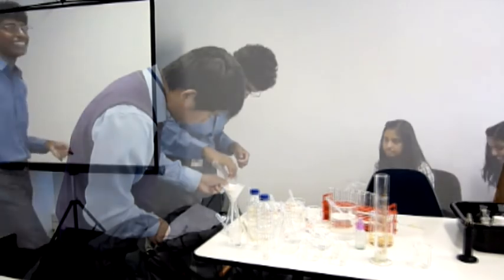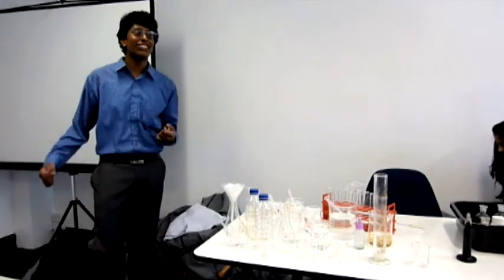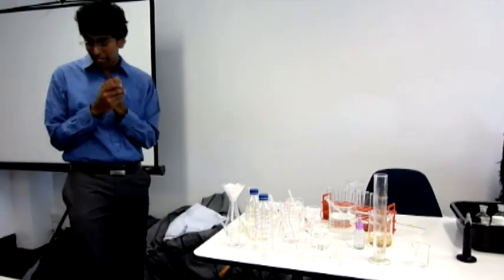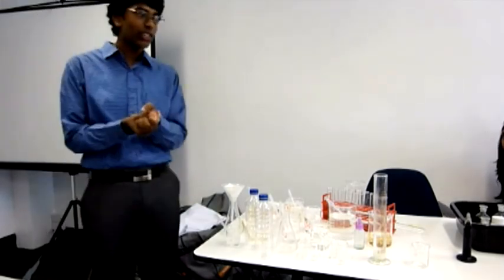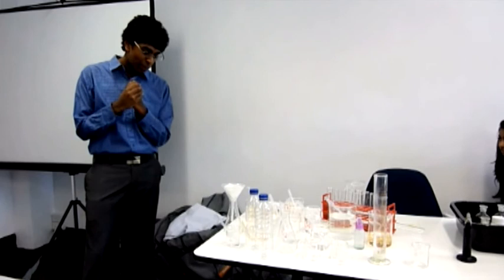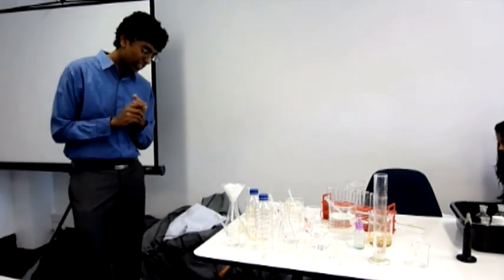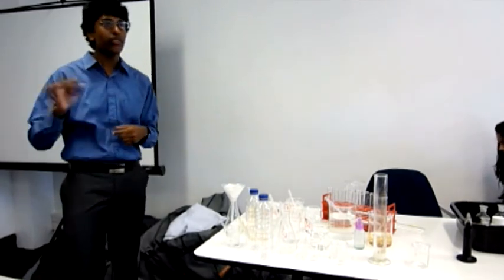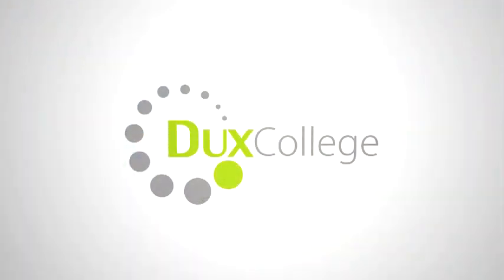We add silver nitrate. Why do we add silver nitrate? Because it's going to precipitate with silver and chlorine. So we get our silver. If there's chlorine, that's the question. If there's chlorine, we can't just assume that it's going to be there, but if it's there we would get a precipitate with silver nitrate. What color is that precipitate? Remember when we do these, in your practice you always write down the color of the precipitate.